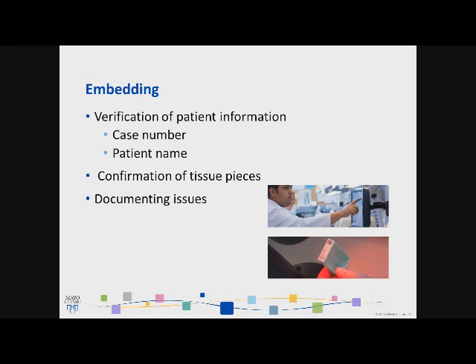Our small specimens do go through the quick microwave processing, so we know exactly which specimens go through which processing. So it's a pretty standardized step. But you can choose to do that if you have more of a random assortment of cases.